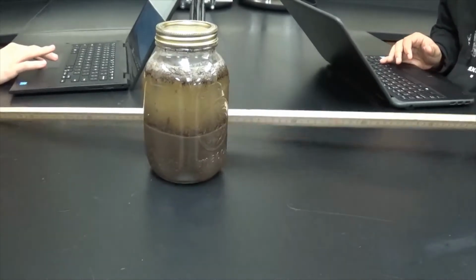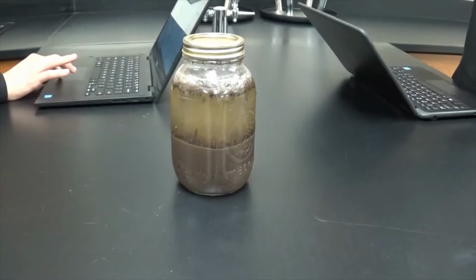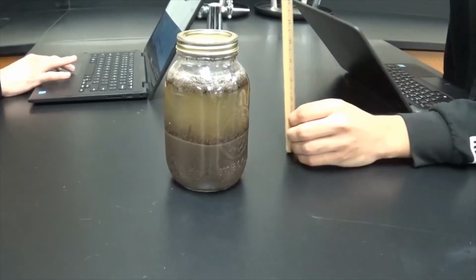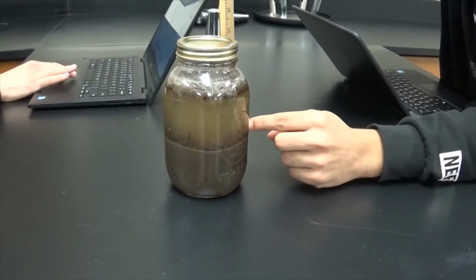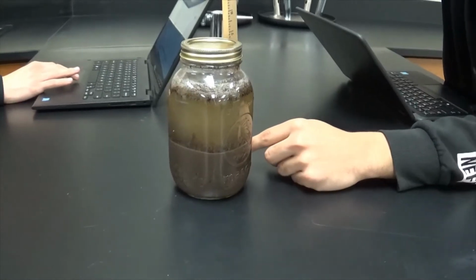Are we supposed to be in a Word document or is it just on Canvas? It's the lab report from yesterday. Go ahead and measure the silt next. That's the next one right here, right? Silt would be the middle one. Okay.